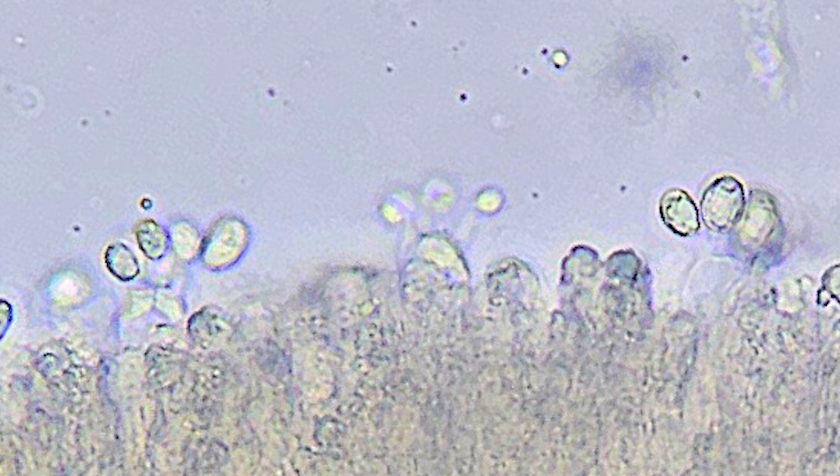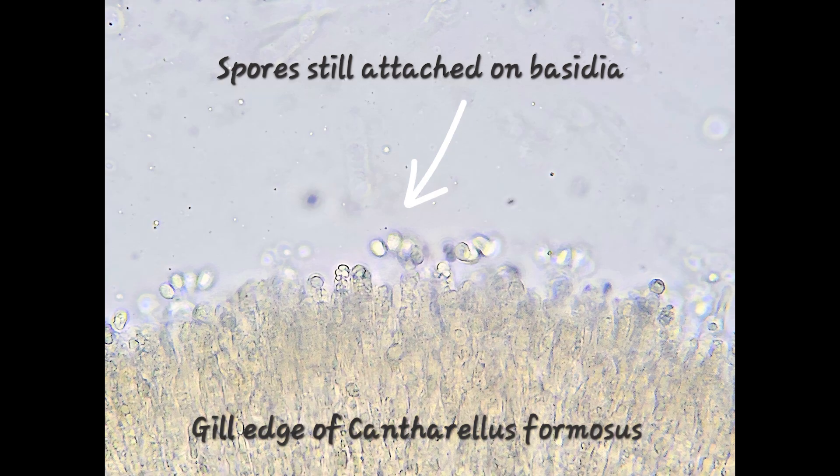Then in the next picture — same thing, spores still attached on the basidia. It's a cool picture. I really like how that one turned out and you can see the melanin — the pigmentation in that fungal tissue is kind of an orange color, just like the chanterelle itself.